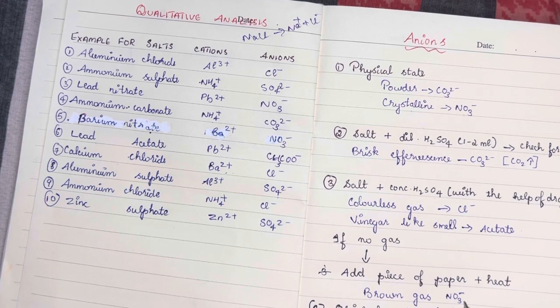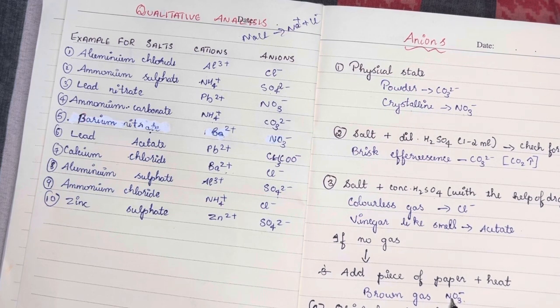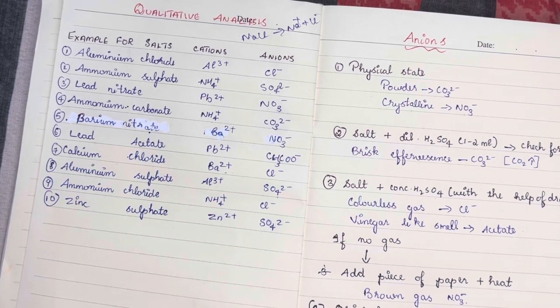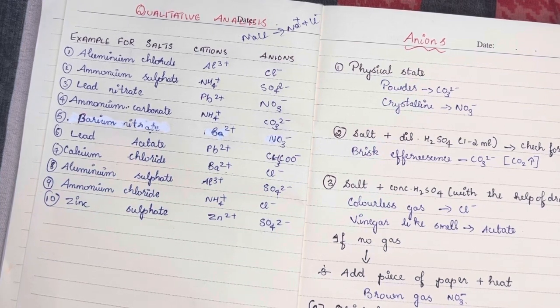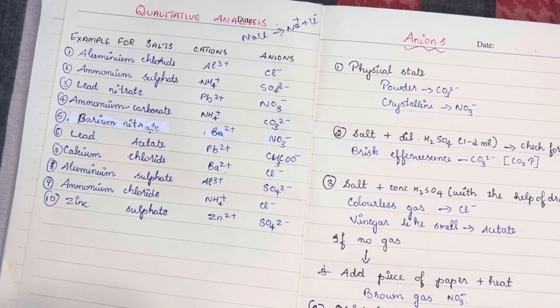If there is no evolvement of any gas, and the carbon dioxide is also not produced, that is, brisk effervescence is also not produced, that means carbonate, chloride as well as acetate are absent. So we have to write that these salts are absent.